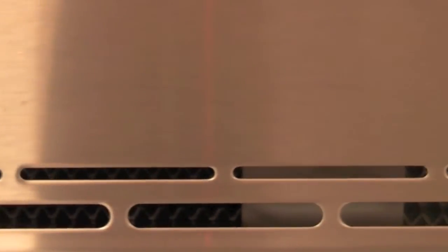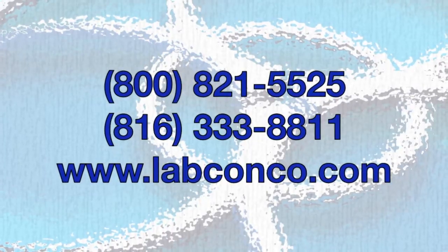Your new pre-filter screens can be removed at any time and cleaned or autoclaved. Replacement filter screens can be purchased directly from LabConco. For more information, contact your LabConco representative.